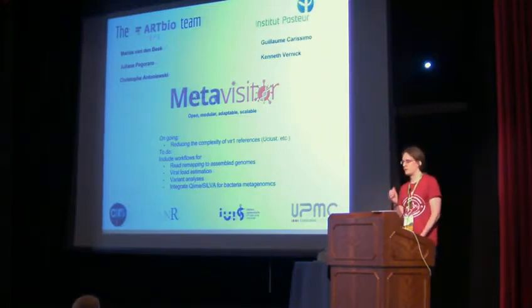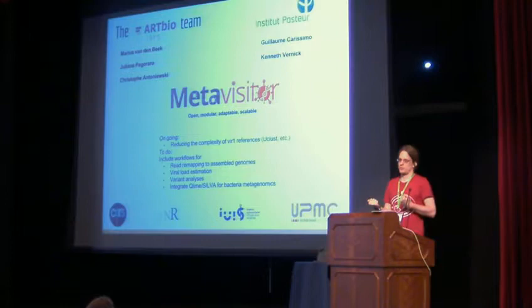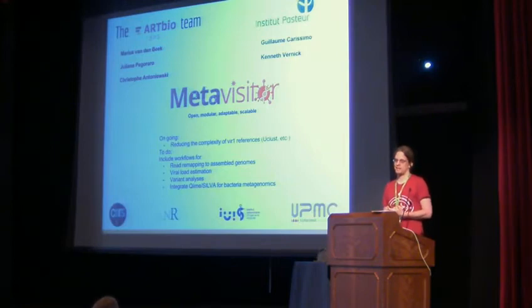The experiment that was published in PLOS ONE was small RNA, yes. For small RNA, they're really small. If you just blast them, you get a whole lot of hits, but you can make it more specific by assembling them. That was the idea. If you're already working with longer molecules, like if you have done RNA-seq with standard length, then it might be more efficient to use an assembler that works better with longer reads, like Trinity. That was the idea. But it also works with DNA, whatever type of sequencing you have. RNA is interesting for viruses because it correlates with viral load.